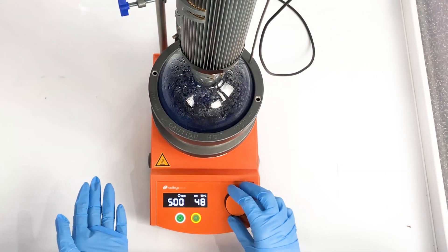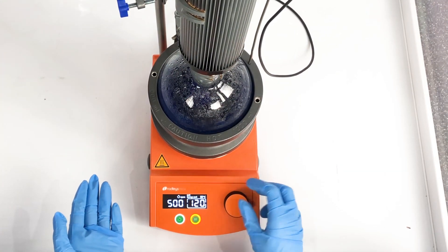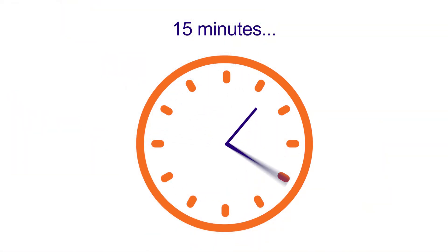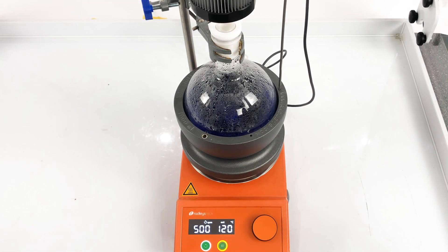Let's heat the block to 120 degrees C and get the flask back up to reflux. And there we have safe and sustainable reflux maintaining the concentration of your reaction throughout.